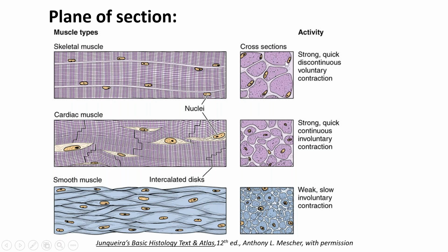If I look at skeletal muscle in cross section, I'm going to see the peripheral nuclei. Generally, they're going to have the same shape, but they may have a little different size. If I look down here now at cardiac muscle, this is where things get a little tricky. If you recall that cardiac muscle is branched, so when we cut through it, we're going to have areas that may be two-sided. There's going to be one that may be a smaller aspect. You may see a nucleus. You may not see a nucleus. This is a very odd-shaped tissue in cross-section.